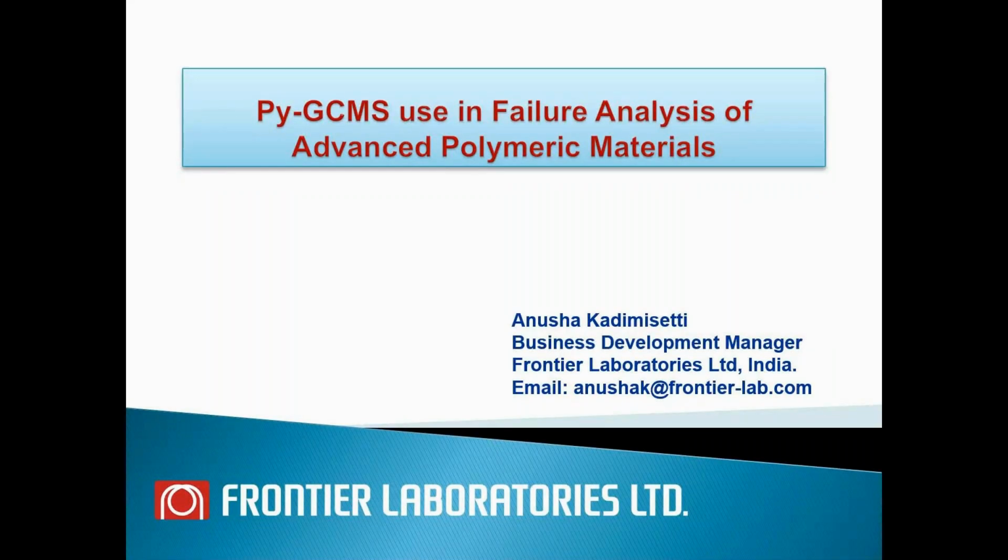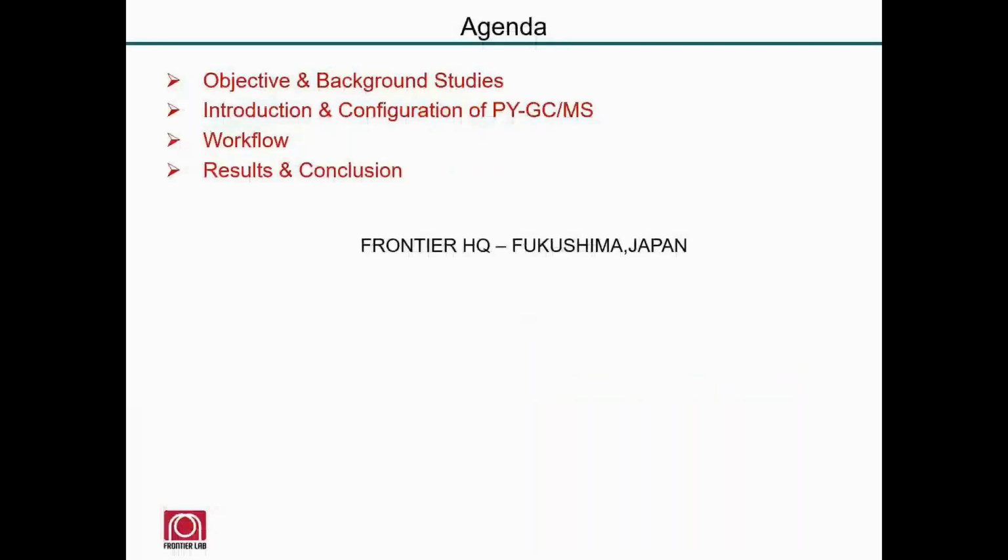Good morning, everyone. Today I'm going to talk about the PYGCMS use in failure analysis of advanced polymeric materials. As the intro was already given, currently I'm working as a business development manager, taking care of the technical marketing activities in India on behalf of the headquarters. In today's talk, I'm going to cover the objective, the background studies, and also the introduction and configuration of PYGCMS, followed by the workflow, giving the example with 2 case studies, and finally the results and conclusion.